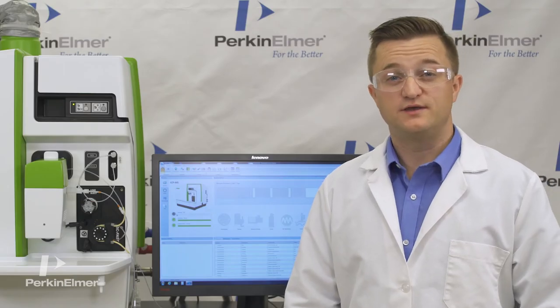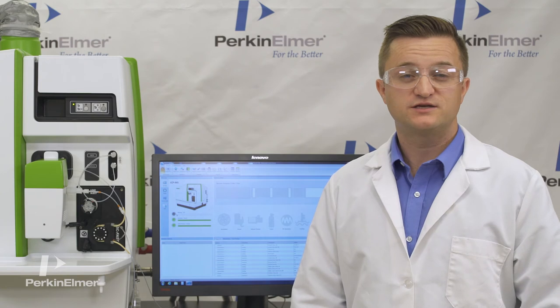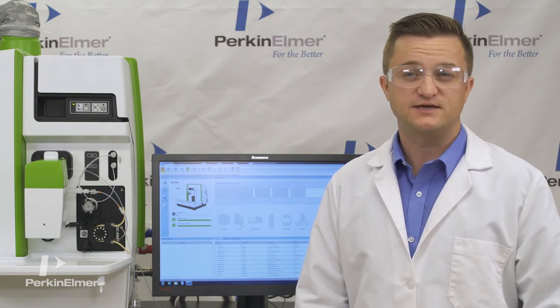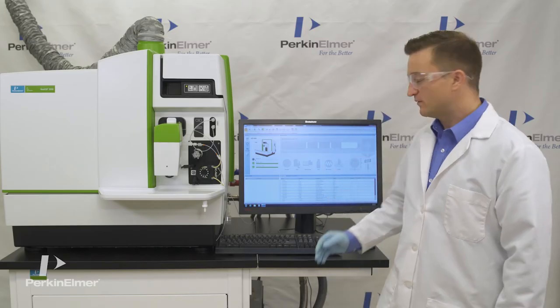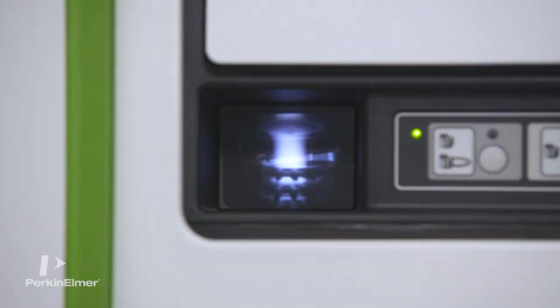And now that we've seen what's new on the Nexion 2000 ICP-MS, we are ready to set up for an analysis. To start the plasma, from the instrument panel, we press the on button.